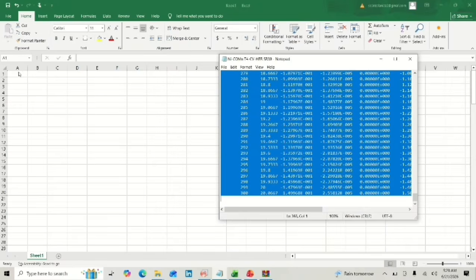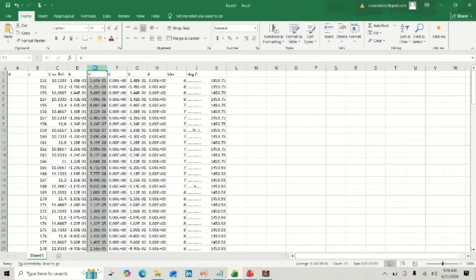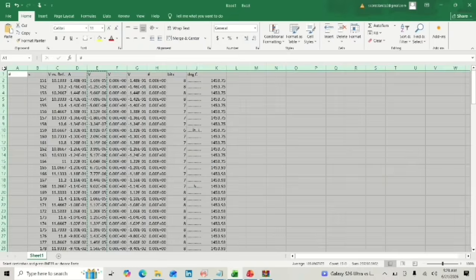Here our potential is measured versus the reference electrode we used in the experiment. To make our data comparable, we need to convert it to the reversible hydrogen electrode, RHE. We will use the Nernst equation for the voltage column.